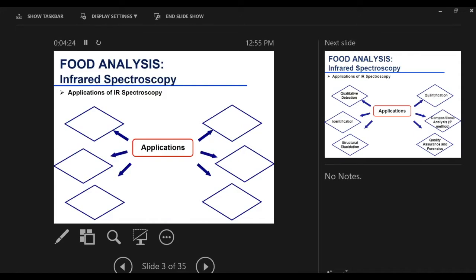So what can you come up with in terms of applications? Things I already said. Yes, Laura? Forensics. So if we're looking at identifying a foreign matter, and I have an example later on, looking at presence of melamine in infant foods or pet foods. So you can look at the IR spectra of the infant formula with and without melamine and try to determine if melamine is present. Okay, what else?